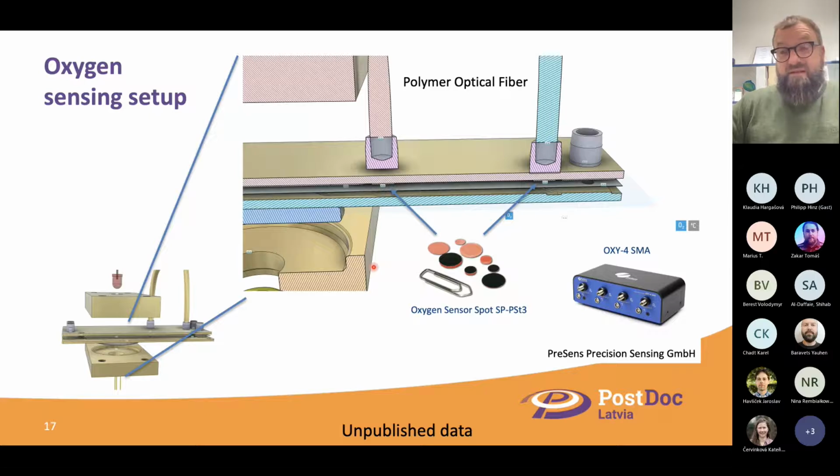From the beginning it looks very easy to do, but in reality it's not easy, because oxygen is everywhere. Measuring the concentration of oxygen in a bottle which holds a medium for cells is fine, but it's really quite hard to prevent the leakage of oxygen into the system.